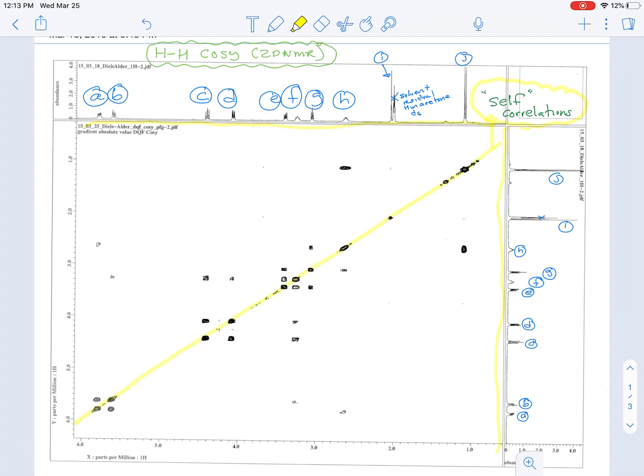So we have A, B, C, D, E, F, G, H, I for the OH, J for the methyl group. And then the same thing here: A, B, C, D, E, F, G, H, I, J.